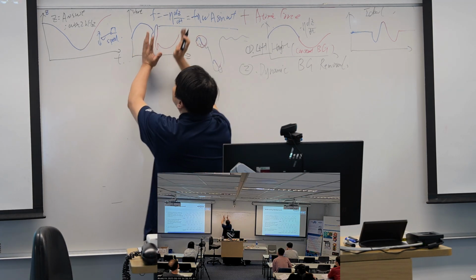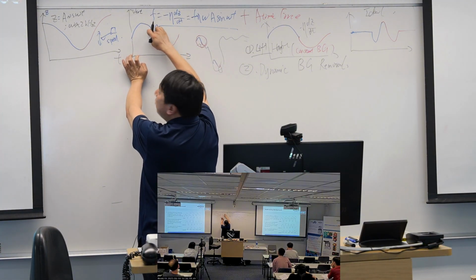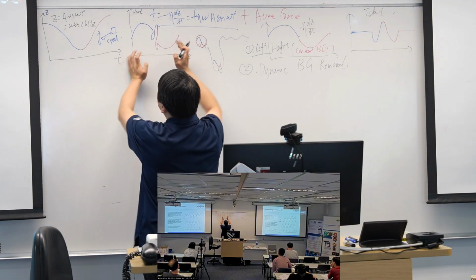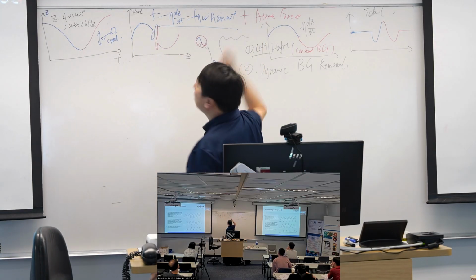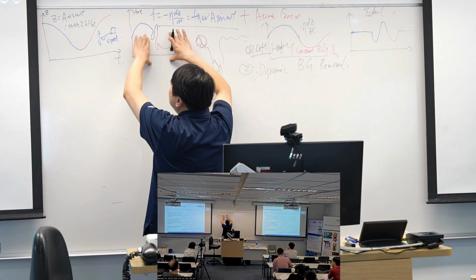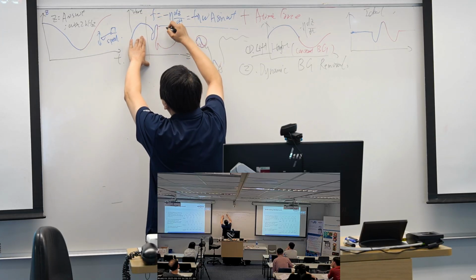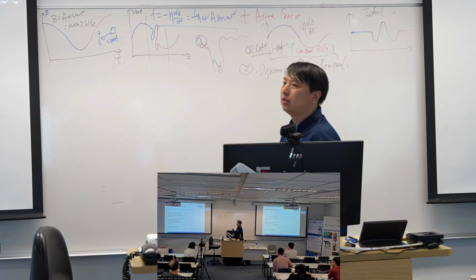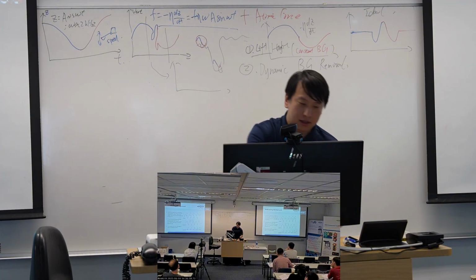So he thinks about it in this way. This part is the sine wave. This part is also the sine wave. Only the central part is mixed with the atomic force. So if from this real-time vertical value, I cut the central part out, I get a force curve, something like this.